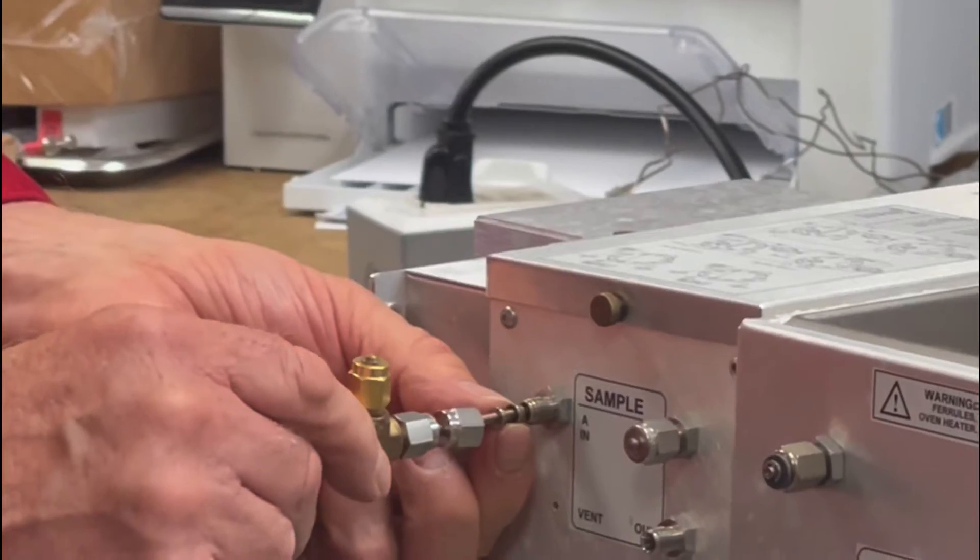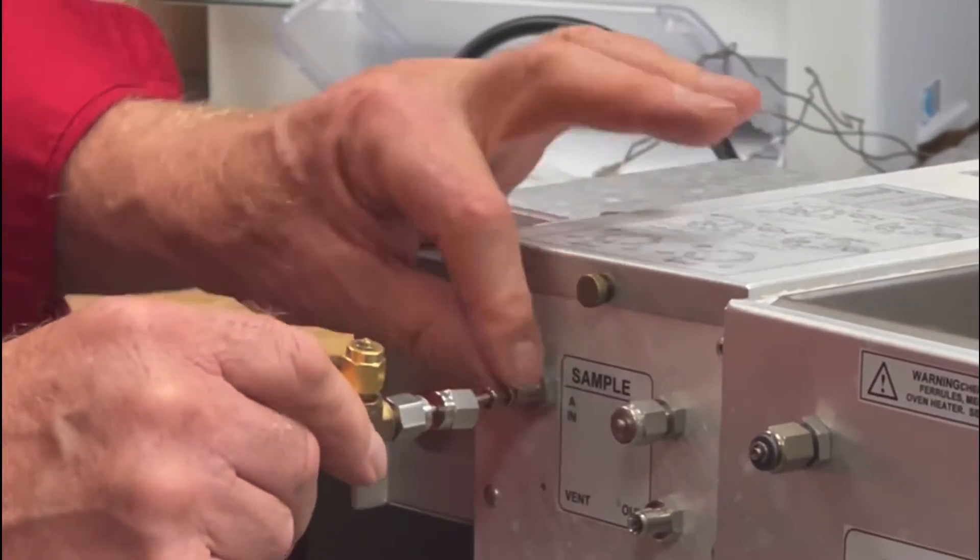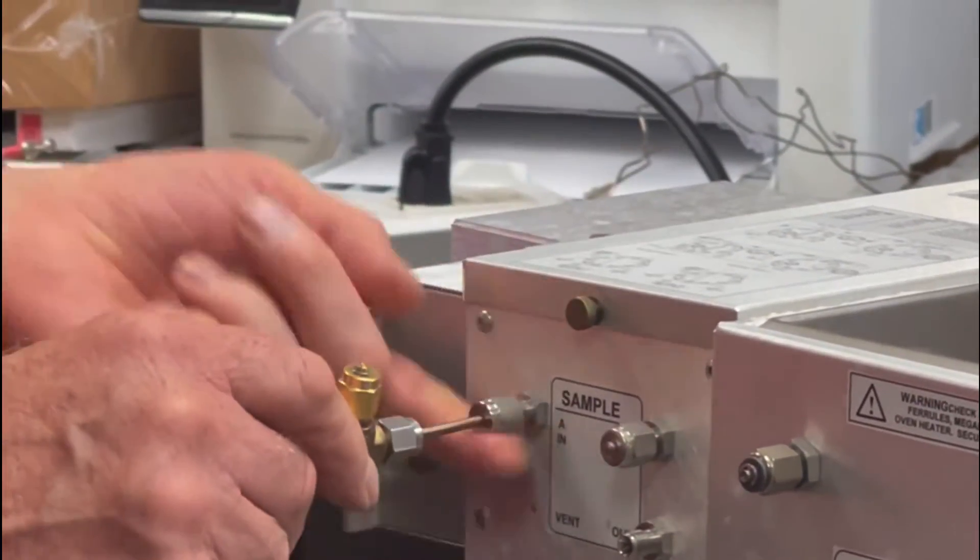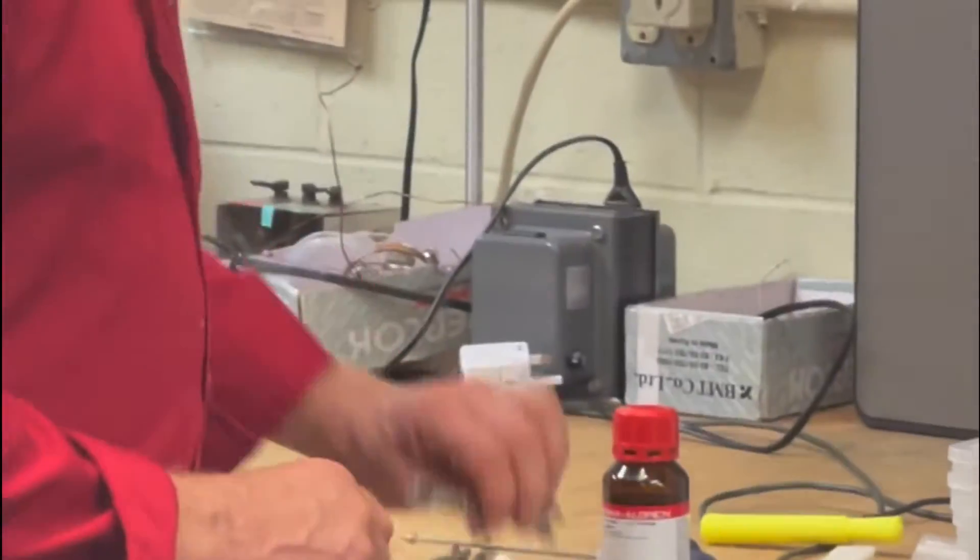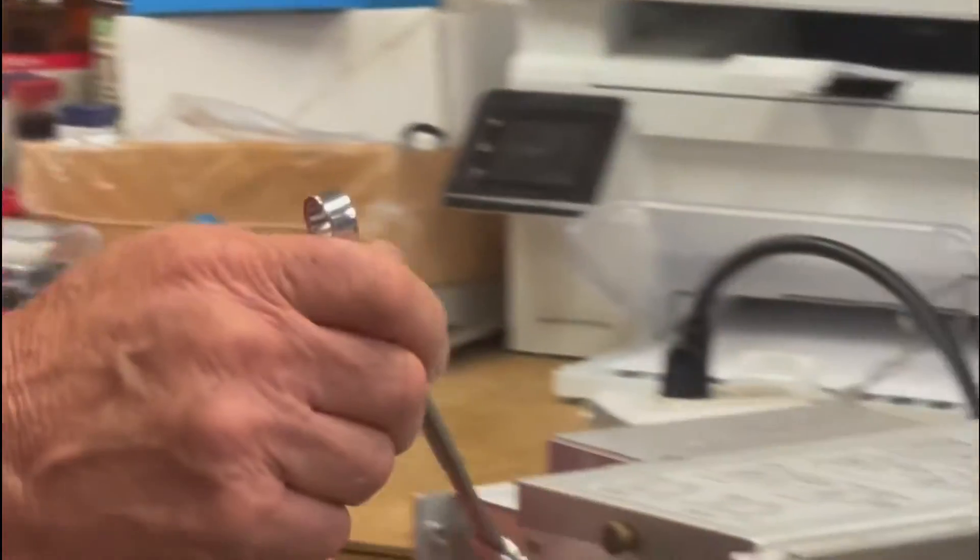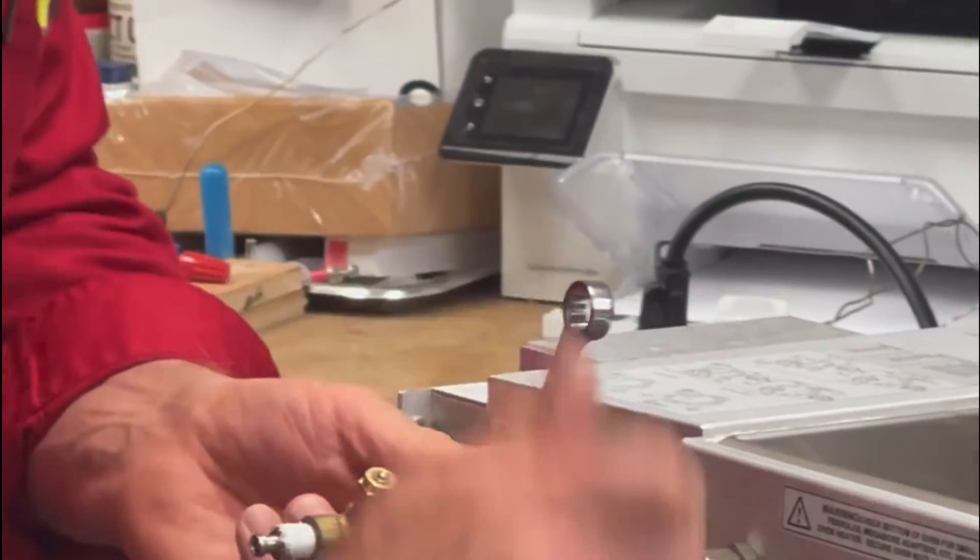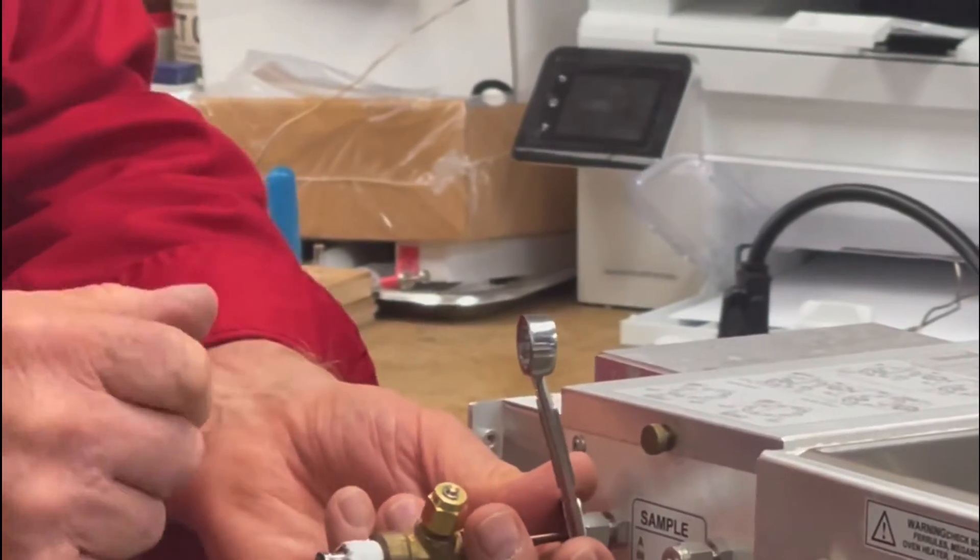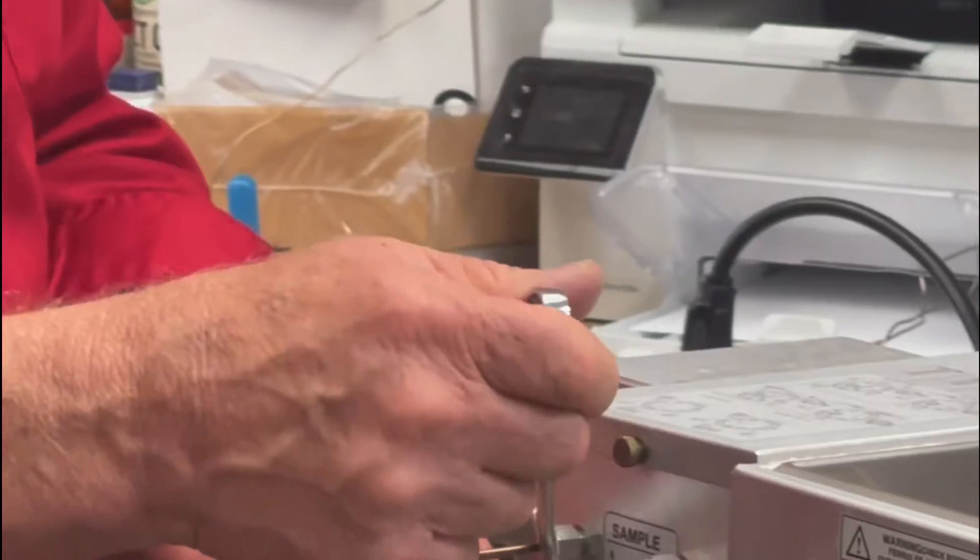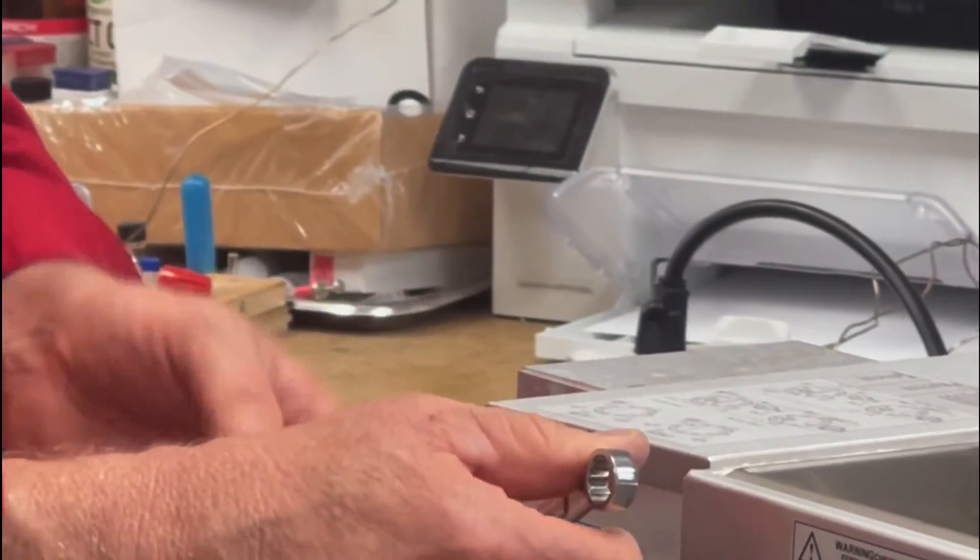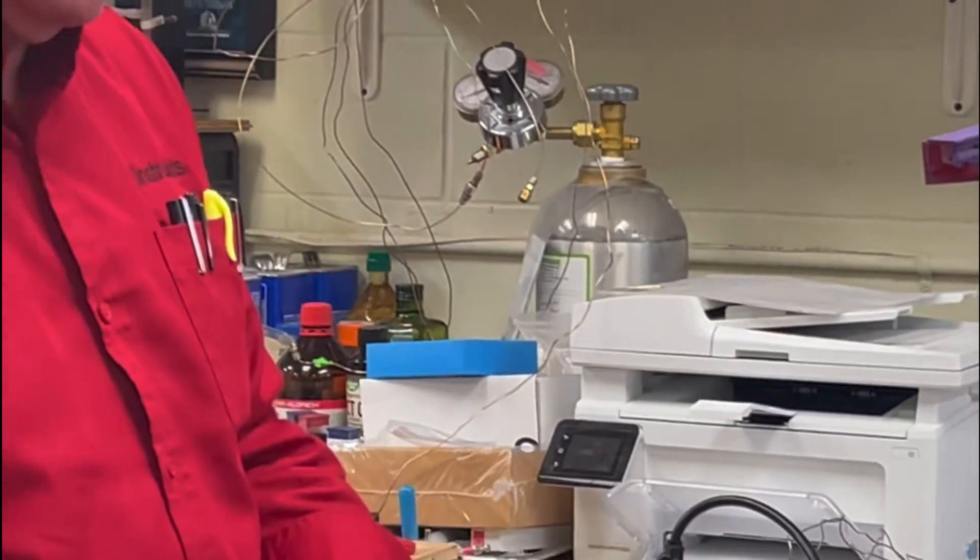The conical shaped ferrule gets squeezed into a conical shaped receptacle and then the nut tightens it down. When you tighten nuts like this you don't want to over tighten them. You want to tighten them to the point where you can feel a little bit of a squish but not keep going because that just distorts the fitting and it eventually breaks. It has to be tight enough but not so tight that you damage the fitting.